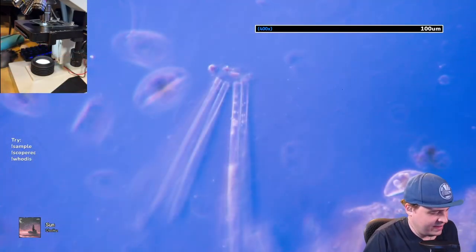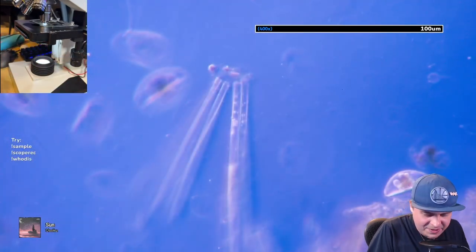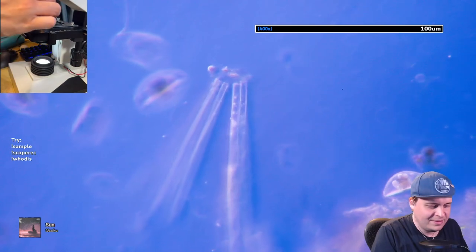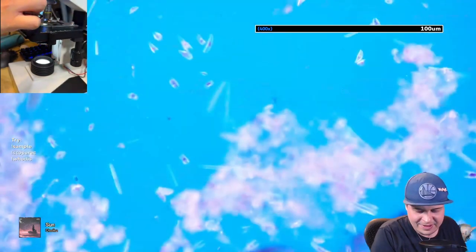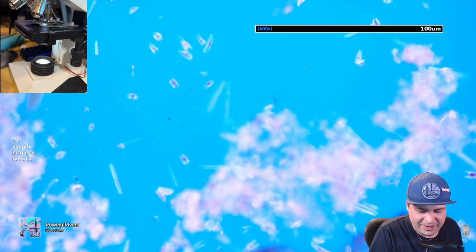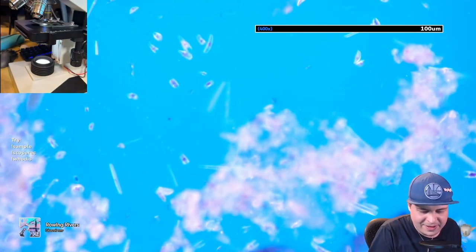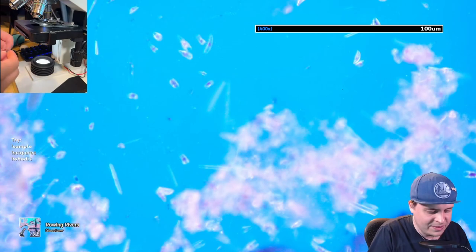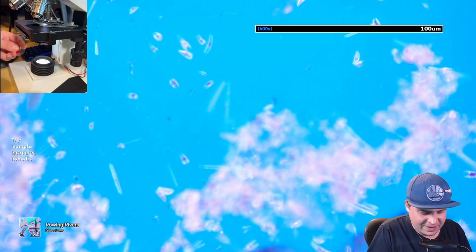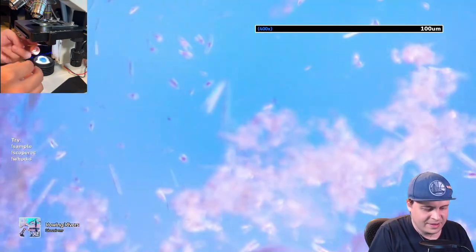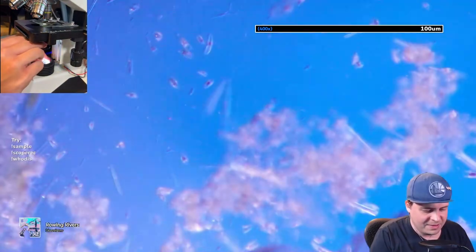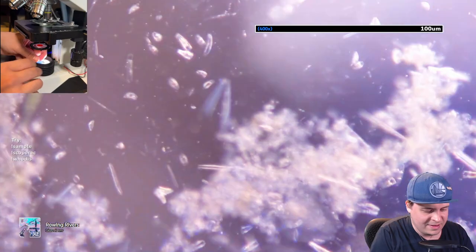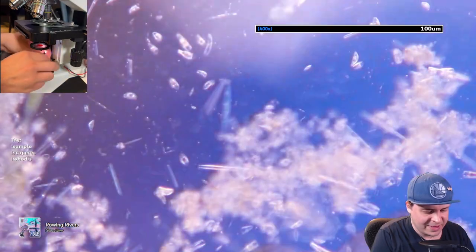Of course you don't have to use blue all the time — there are other colors besides blue.